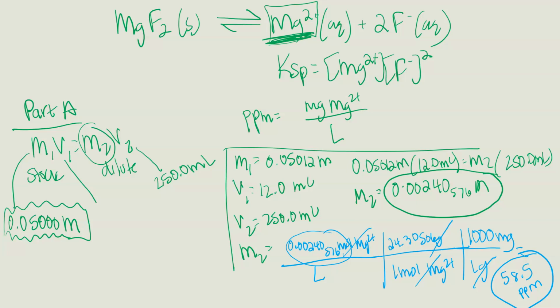Okay, now hopefully you will not have to make a graph. Okay, so I'm just going to go through the assumption that you don't have to make a graph. Okay, so let's move over to part B. Part B took a lot longer in the lab, do a lot of stuff, make the solid, rinse it, centrifuge, vortex, all that good stuff.